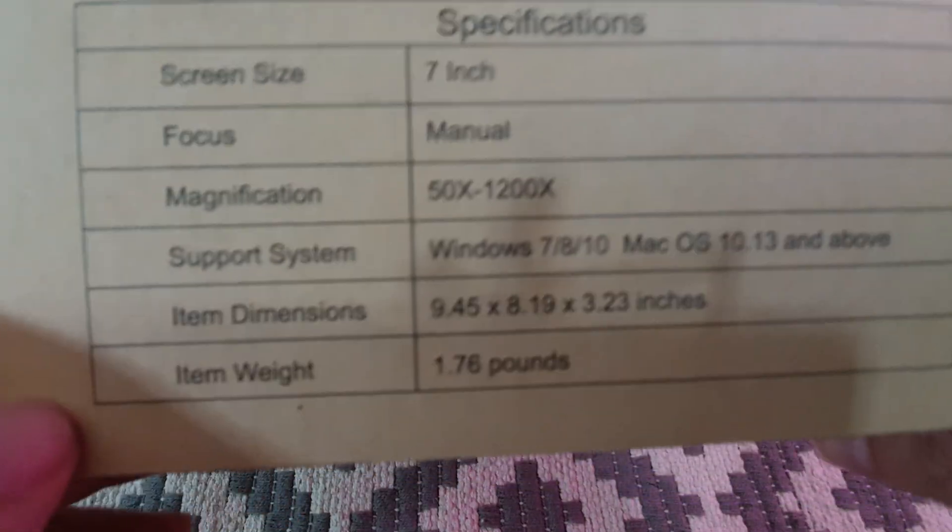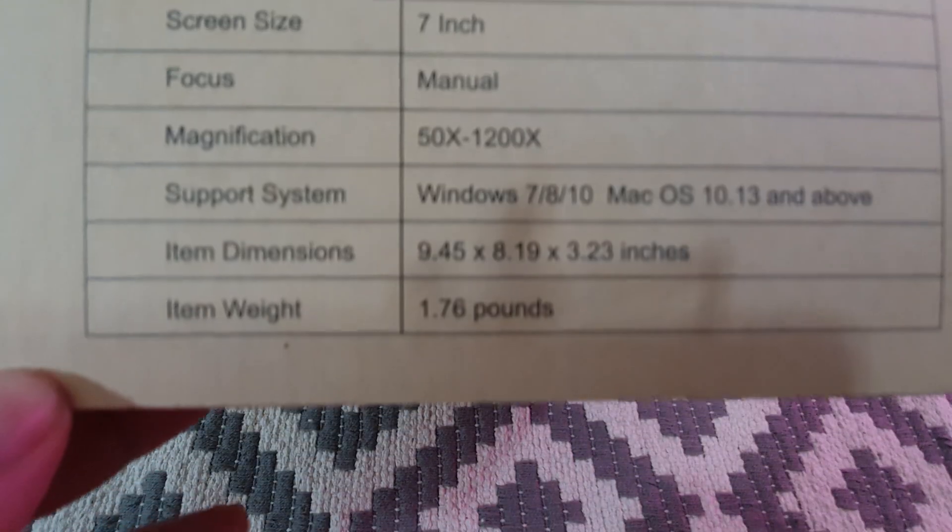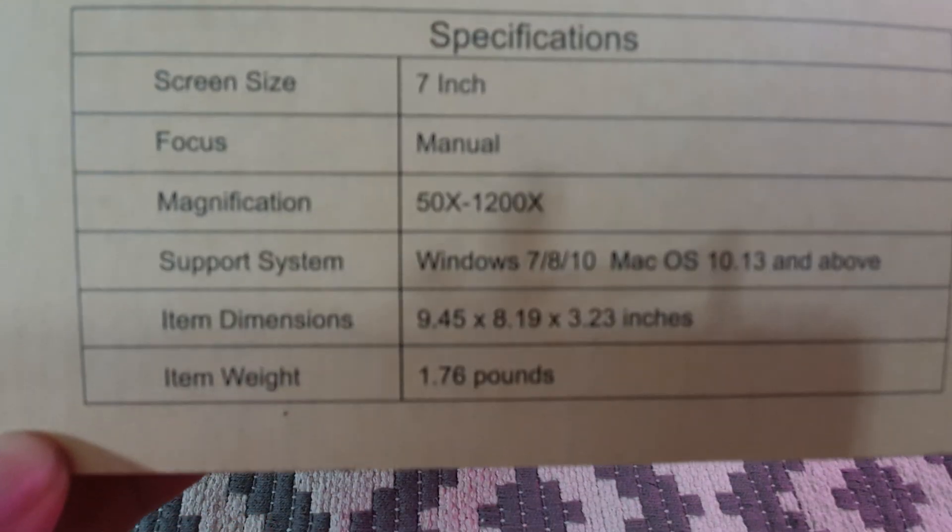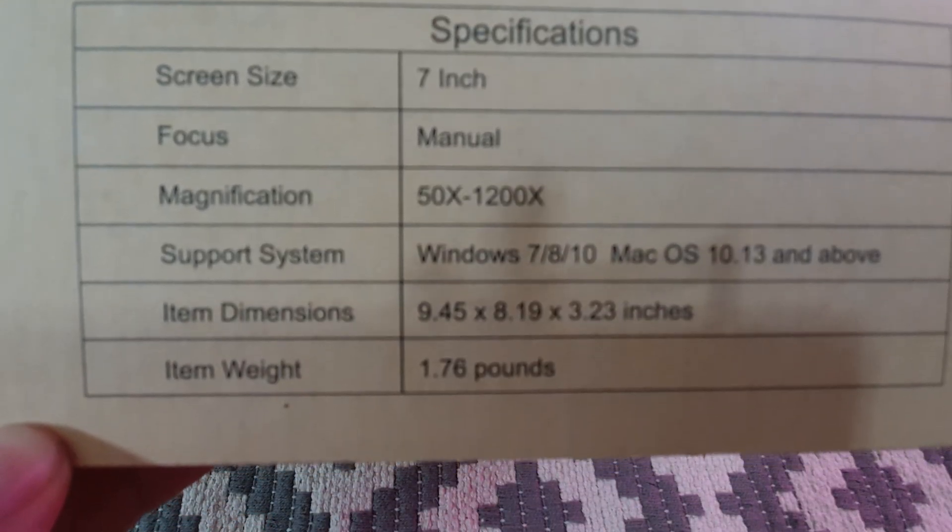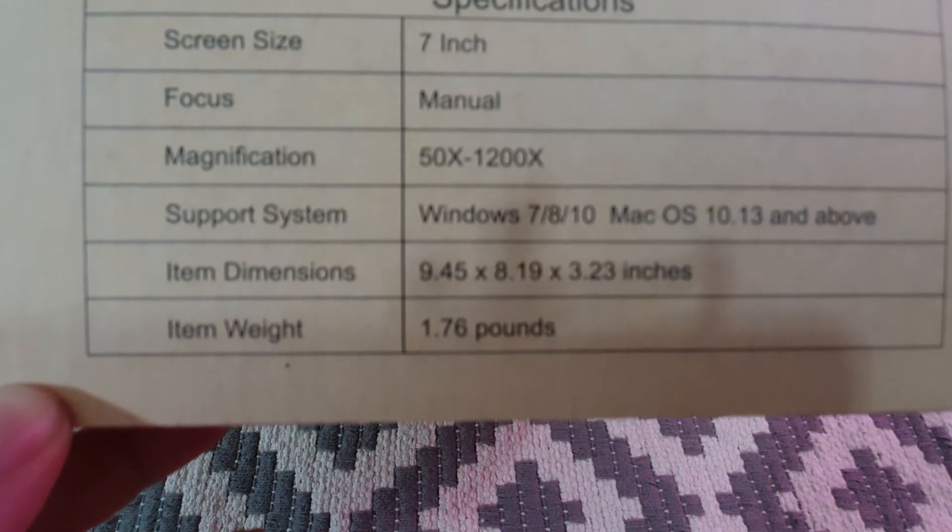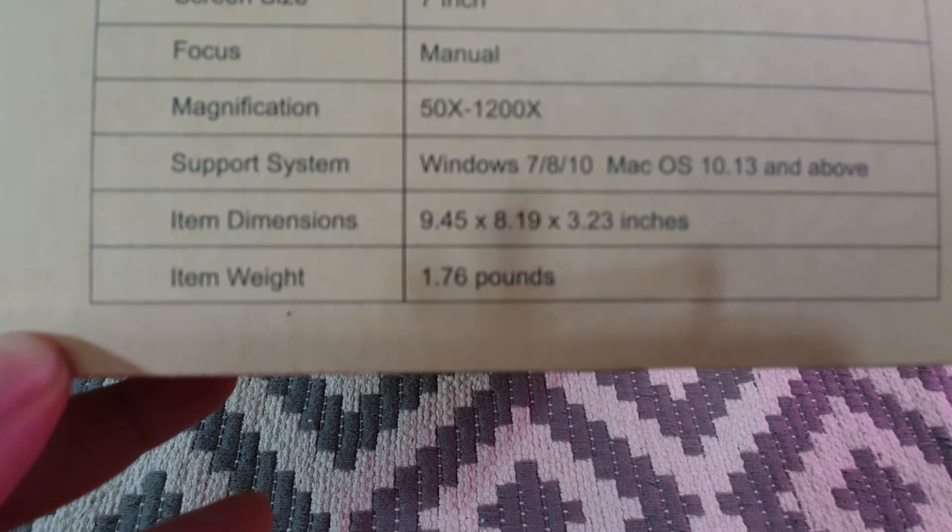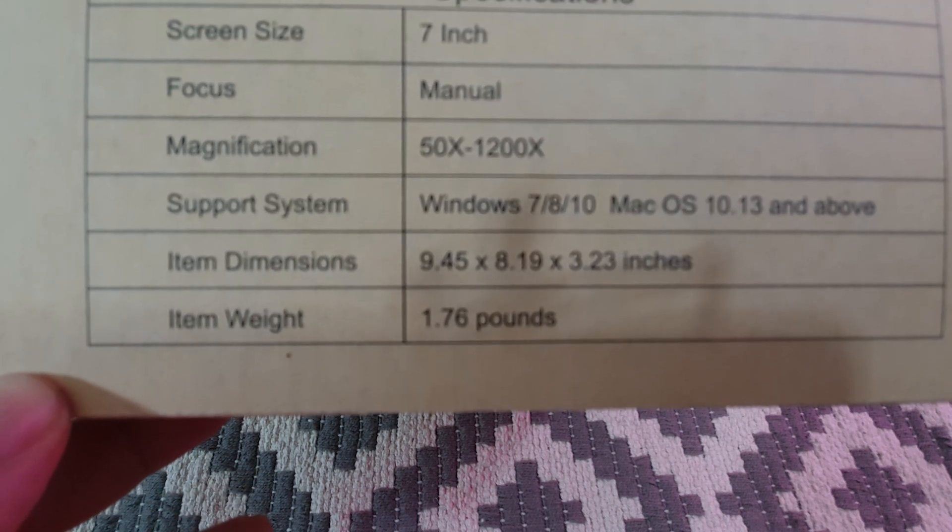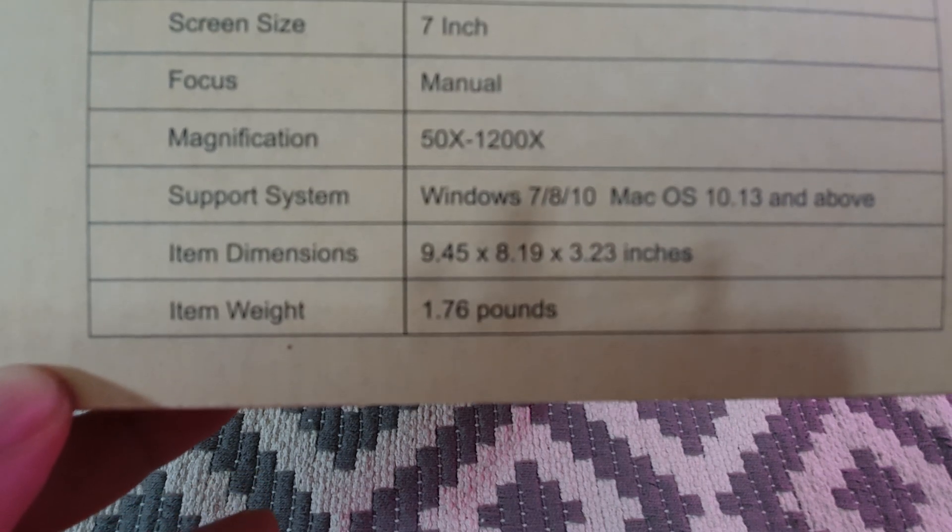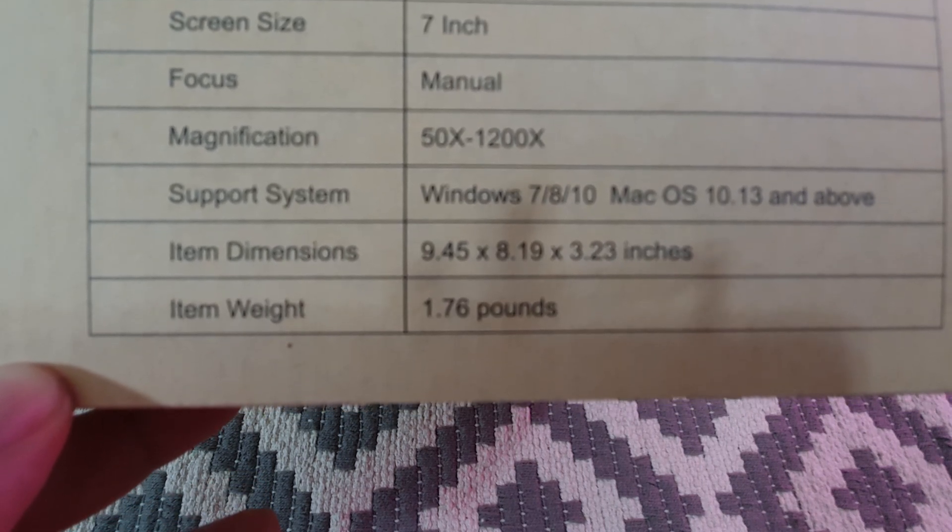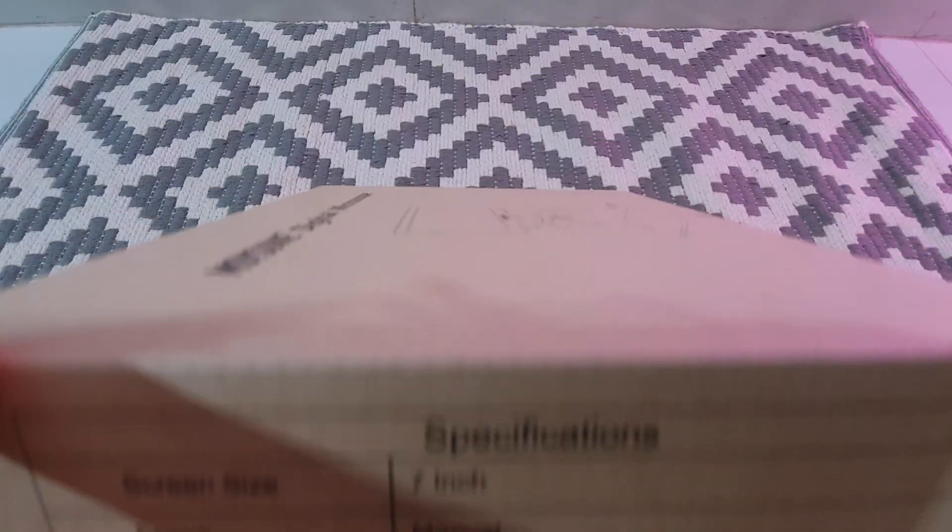Let's turn this over. On the back you can see that it talks about the magnification. This offers about 50x to 1200x, that's a claimed one. It's got a seven inch screen and it's about 1.76 pounds or maybe 700 grams, so pretty lightweight.